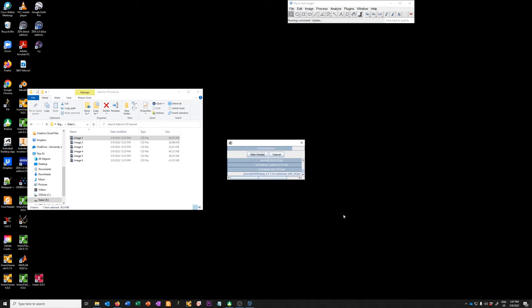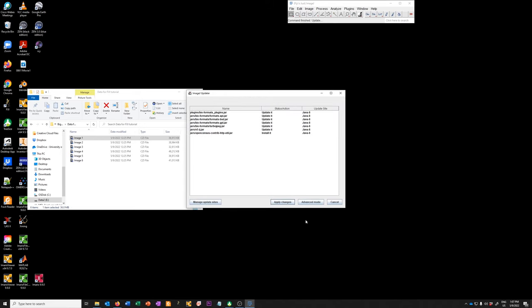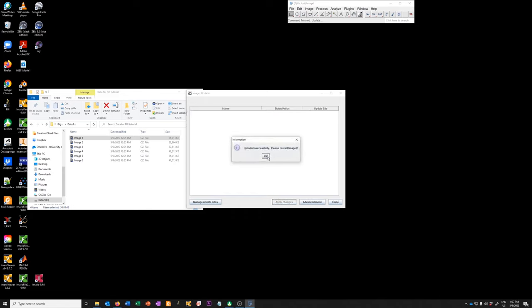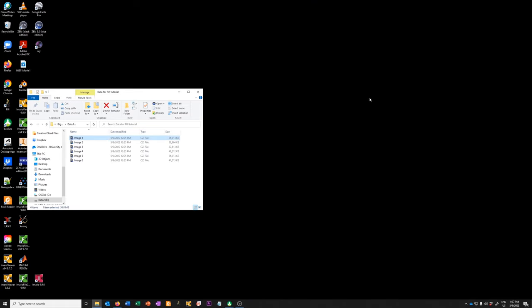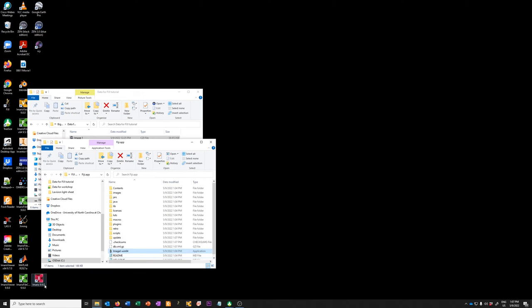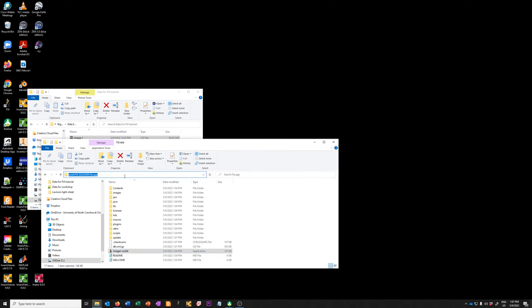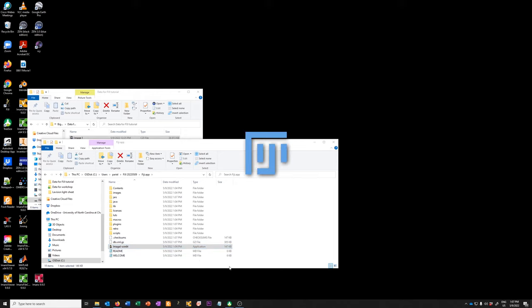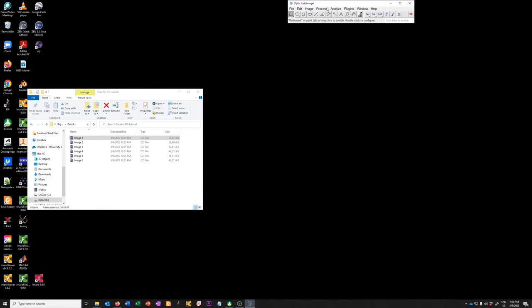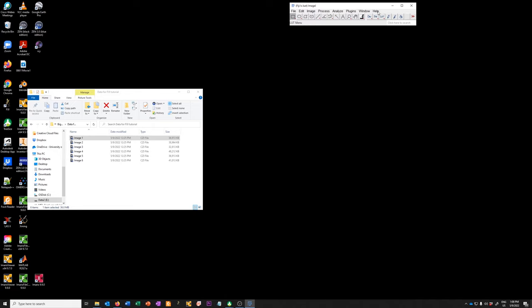There are a few plugins it wants to update and something it wants to install. If we say 'apply changes' it will download what it needs and then prompt you to restart ImageJ. We close this and restart it. You can see this is the updated version we just installed in the user space folder with today's date. If you run the updater again immediately after updating, there won't be any more updates to take care of.